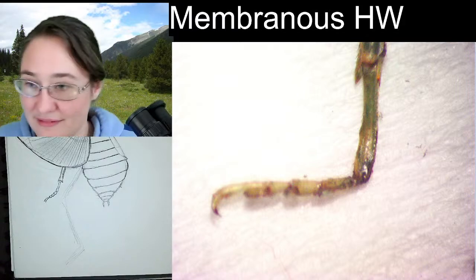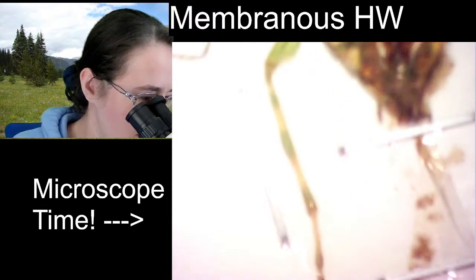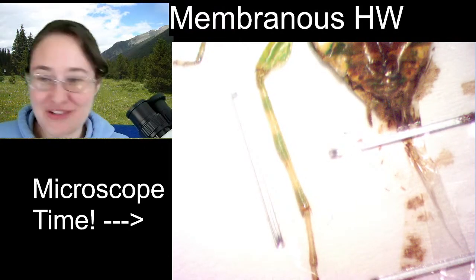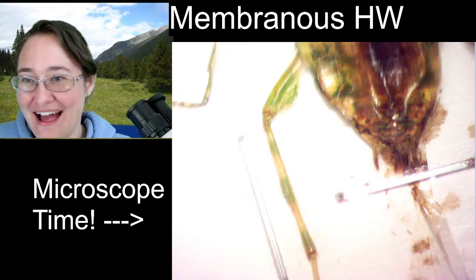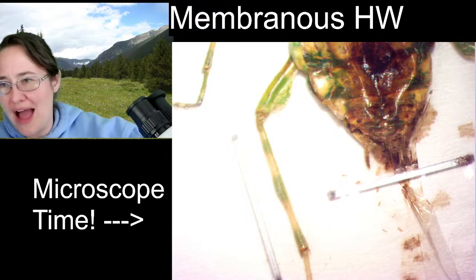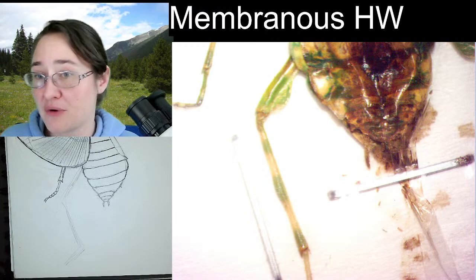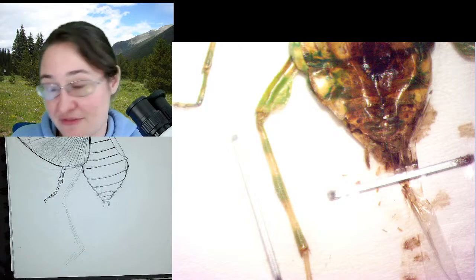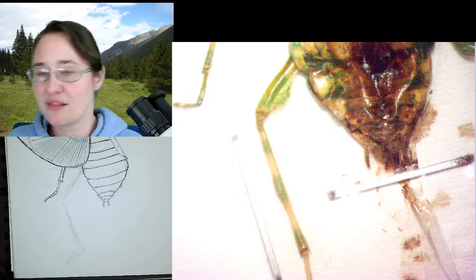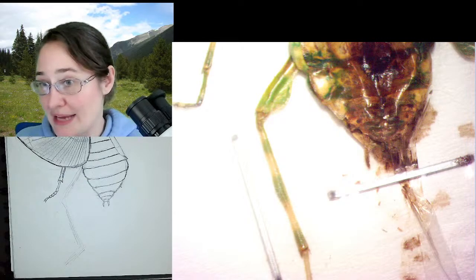Let's do the hind leg. Oh, look at it, the hind tibia is annulated. Using my new word again. Also, the hind femur is kind of wide. Flower mantids are well known for having mimicry of flowers. So, for instance, the orchid mantis is a species of flower mantis. This is a jeweled flower mantis. They regularly have leaf shapes in their legs or mimicry hidden throughout their body. So, that's just another fun little tidbit.